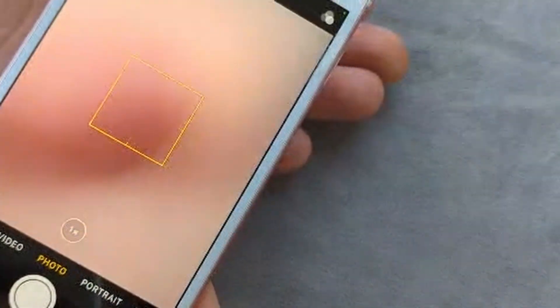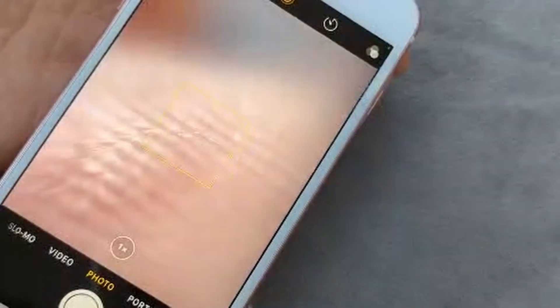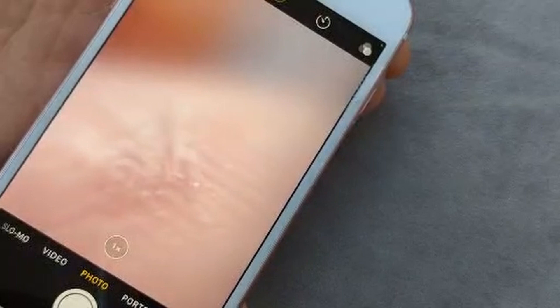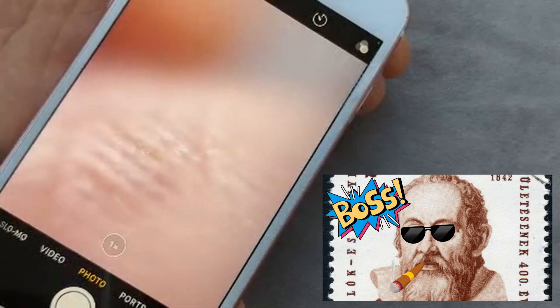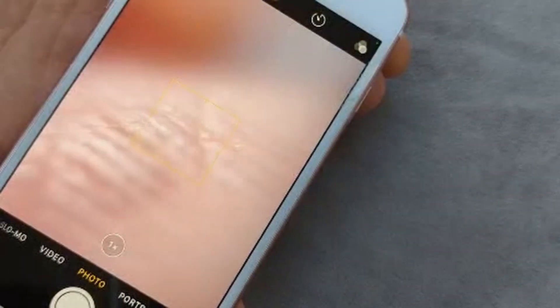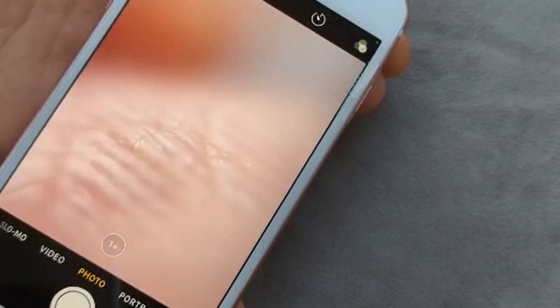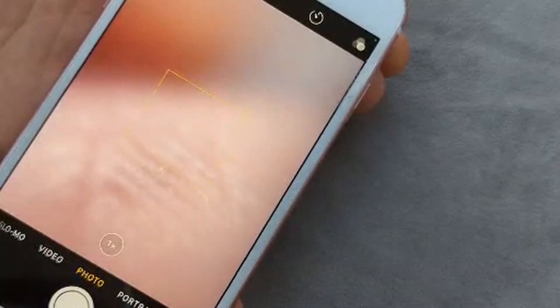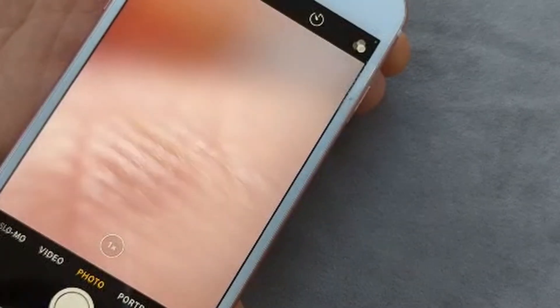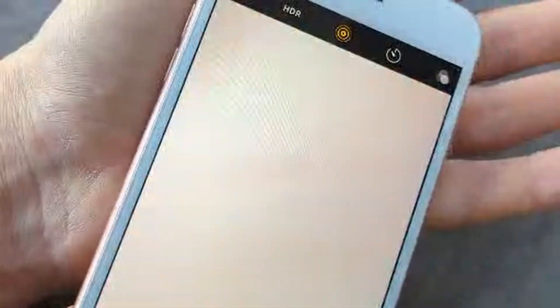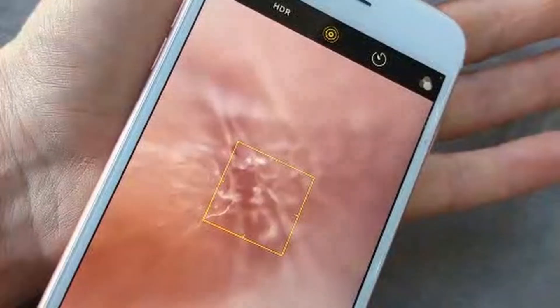I thought it didn't work at first — it came out quite blurry initially. And then all of a sudden, I had that eureka moment that Galileo must have had all those years back. I found that I could actually see some really quite interesting things on the palm of my hand — namely, how manky, cracked and chapped they are.